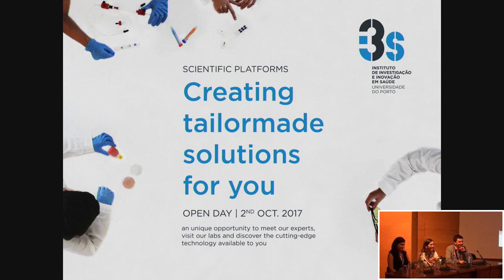Hi. The question is for André. The screening unit, is it only for cells? Or do you have experience and possibilities to do screening with small animals, let's say like zebrafish or Drosophila?